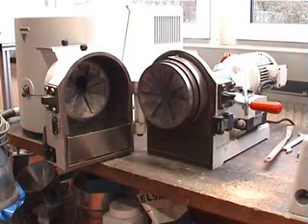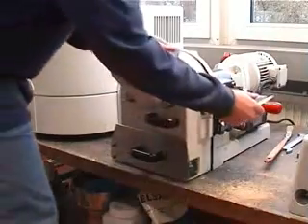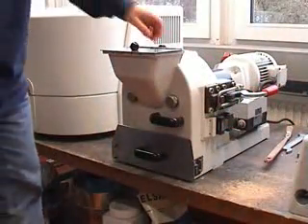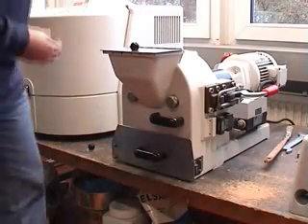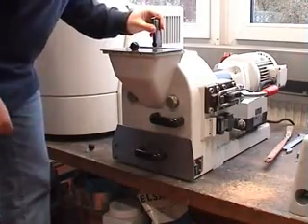The final size of the material will be set by the gap between the two discs. Therefore, I will close the mill again. On top of the mill is a small hole — you can remove this part here and with a tool you can measure the gap between the two discs.